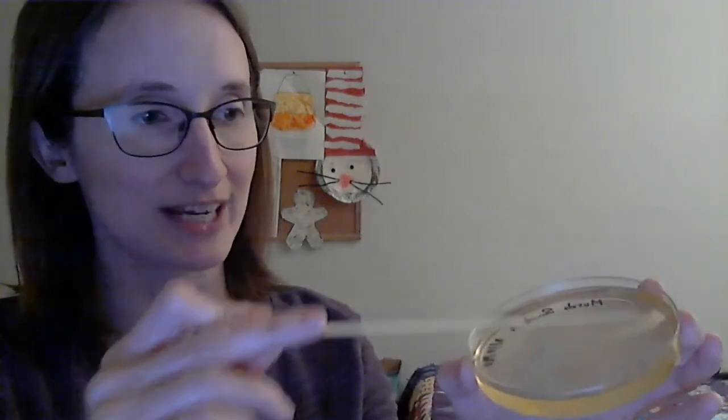You might want to turn the plate at one point so you can spread in all directions. Do it very gently — do not push down and stab the agar. As soon as you're done spreading, immediately put the lid back on the plate to keep it sterile. The loops go in the autoclave bag at the front of the room. You'll probably want to give it a few minutes to allow all the liquid to fully soak in, and then the plates get incubated.